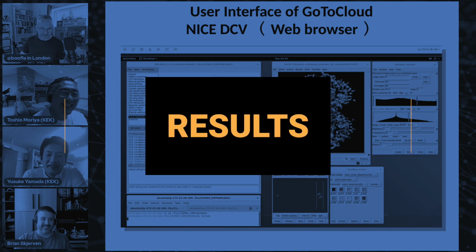Problem solved, apparently. You're saying prior to this, you were literally doing the experiment, gathering the data for the customer, sticking it on a USB hard drive and FedExing it to them. Yeah. But with our facility, we do differently. Right. So most of the facilities, what I heard is basically they are still using the hard disk solution, and they don't have the download server. So we are sort of advanced, in my opinion, about this aspect.